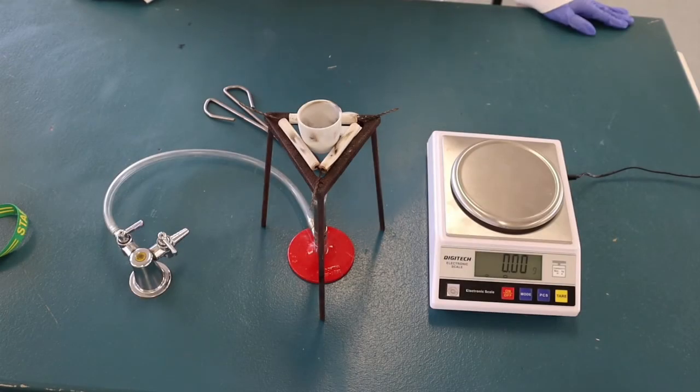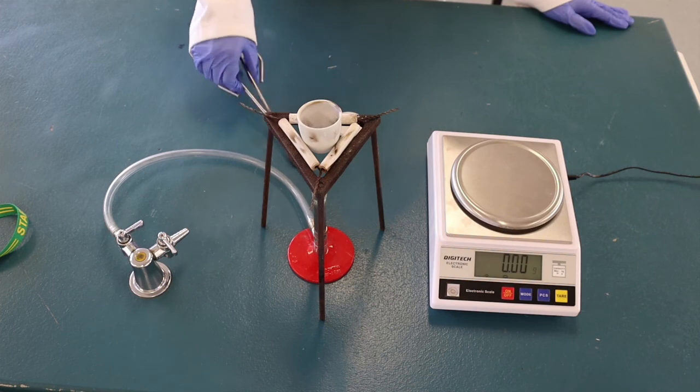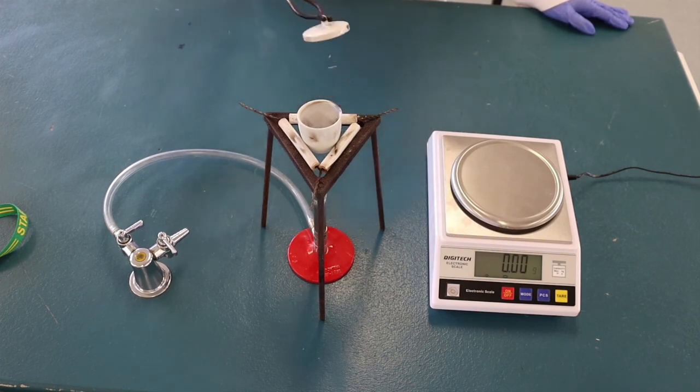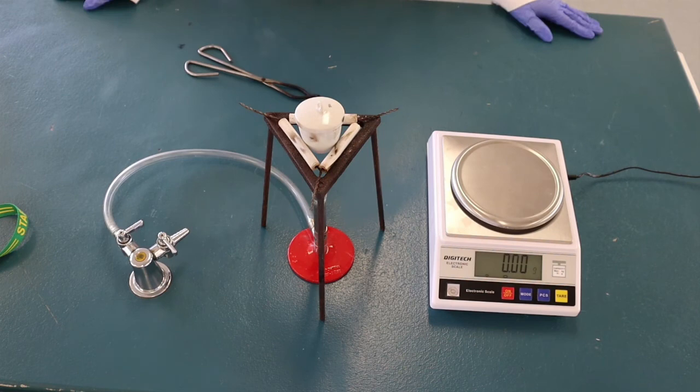Replace the lid and allow the reaction to cool. Reweigh the crucible lid and magnesium oxide.